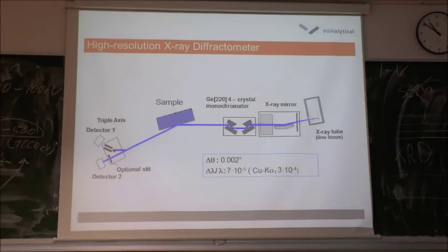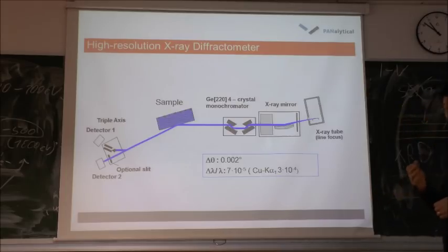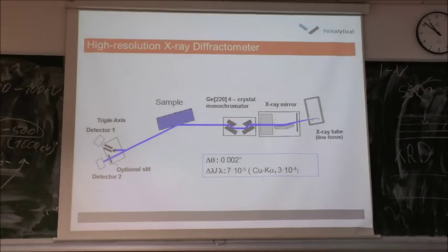But then we decided for 2-bounce crystals because they have, for the system that we are looking at, a good relationship between the resolution and intensity. Yeah. So this kind of geometry is used, let's say, when you grow semiconductor materials on semiconductors. Because this is really high-end epitaxy, or single crystal growth of materials on single crystals.